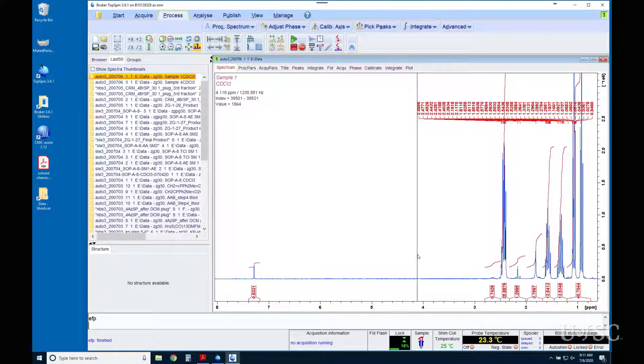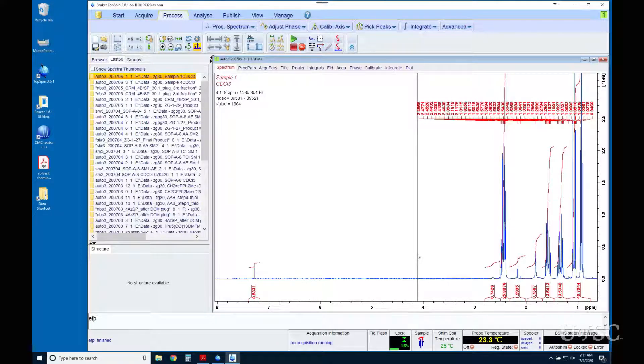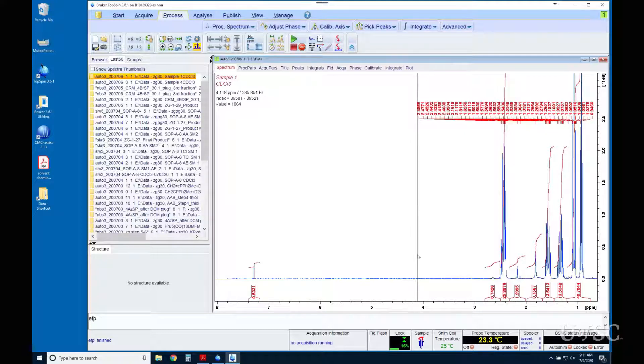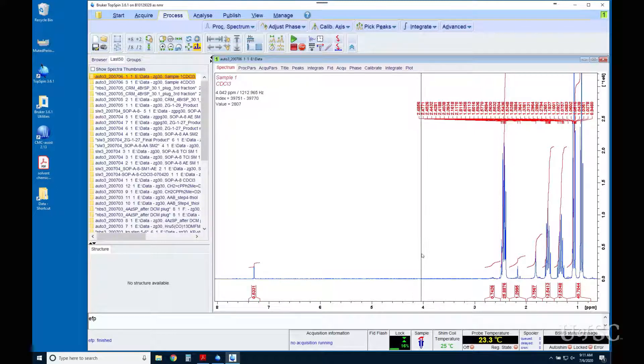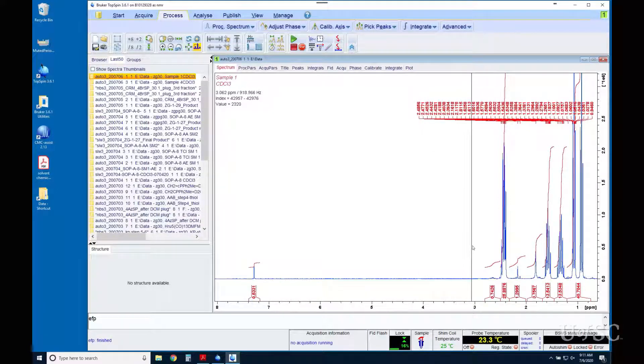The E is for exponential multiplication, also known as line broadening. This is a noise filtering step that will improve the appearance of the spectrum. The consequence of this step is a loss in resolution, thus the line broadening name.